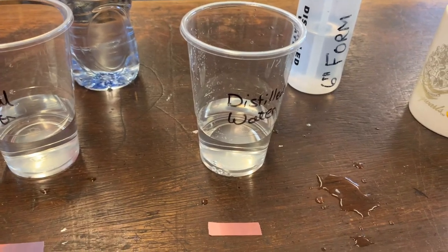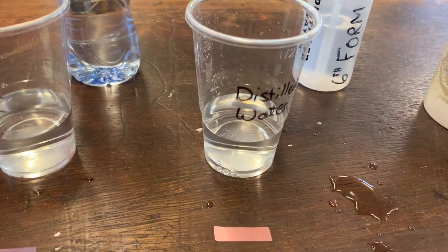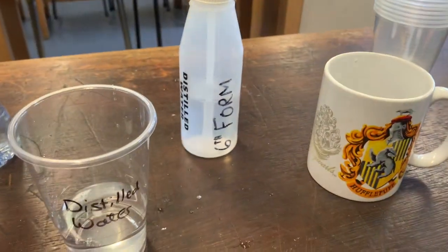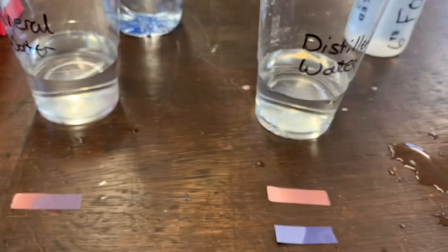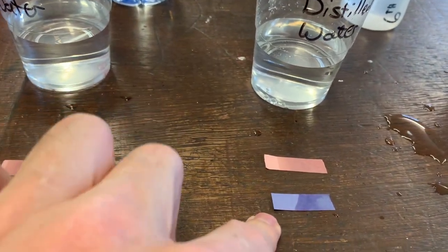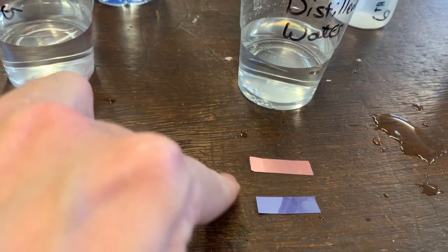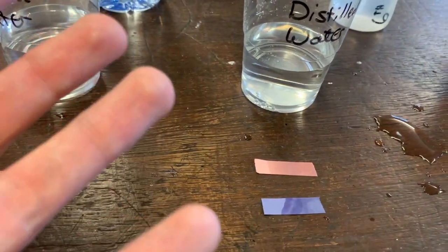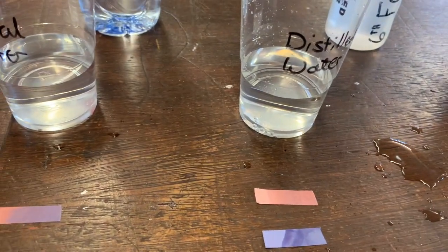Right, we're going to repeat the experiment with the blue litmus paper now. So in the distilled water, no change. If we see here, we've got that the red litmus paper is red, and the blue litmus paper is blue. So this means that it's not an acid and it's not a base — therefore this distilled water must be neutral.